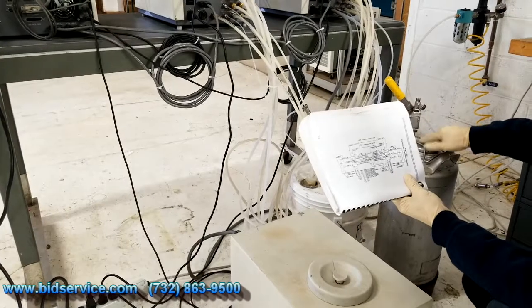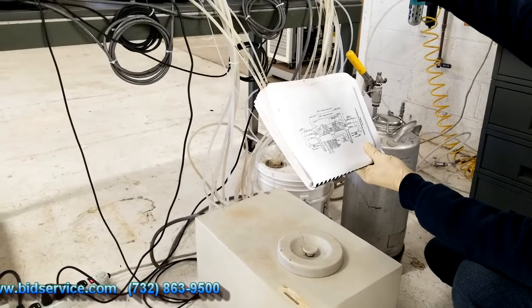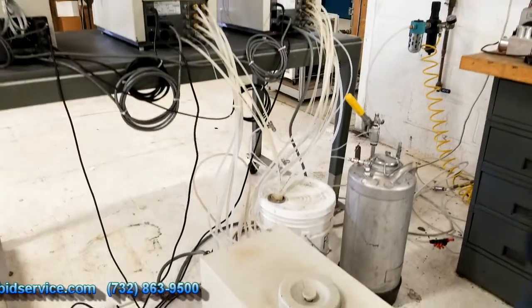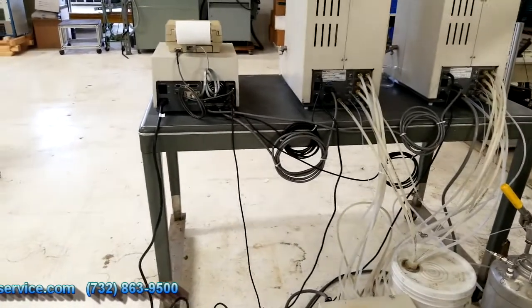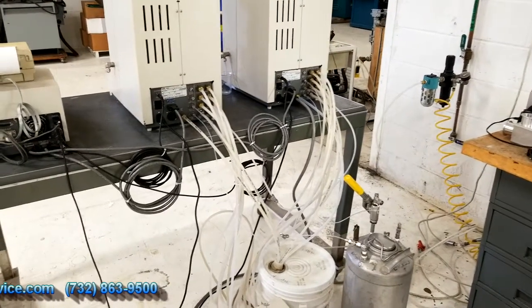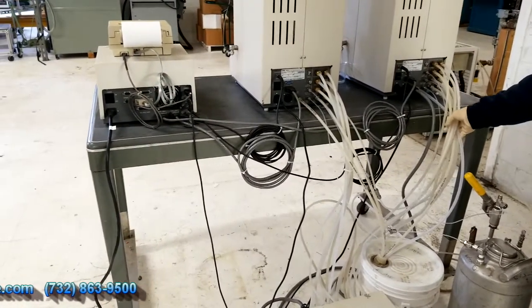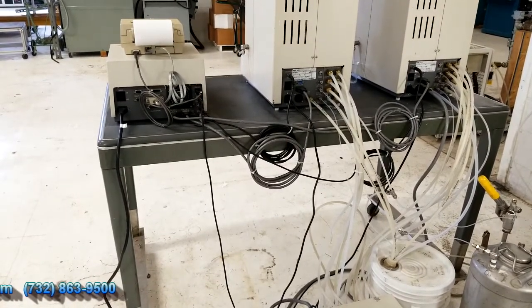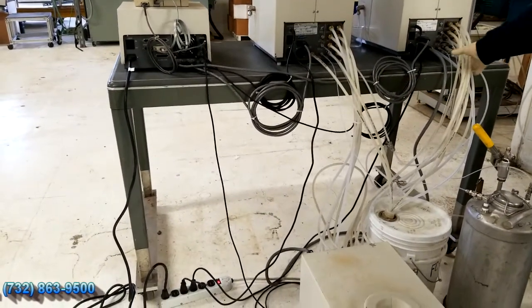And again, we're only using one rinse tank, and that's with the distilled water to clean out the vessel after the bomb has been completed. And this is our carboy again. And we are supplying 100 PSI to both towers from our house CDA system. Now you can use a CDA system or you can use N2. And again, all your tubing here, I'll send this along. It's what I had here and I just adapted it to work. All the requirements for the exact tubing is in the manual, if you decide to use what is in the manual. But I'll send this along anyway.